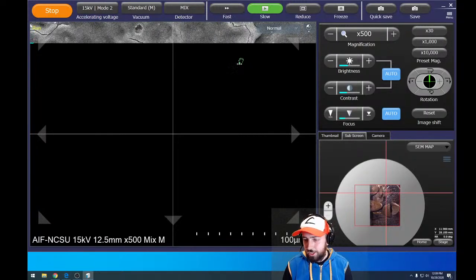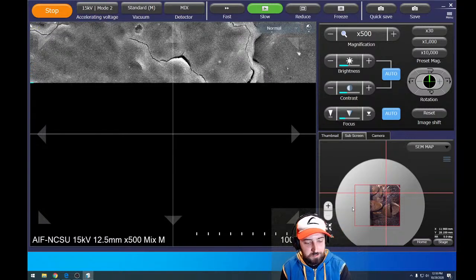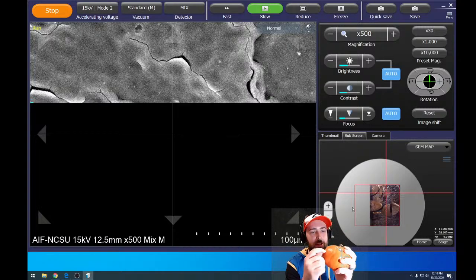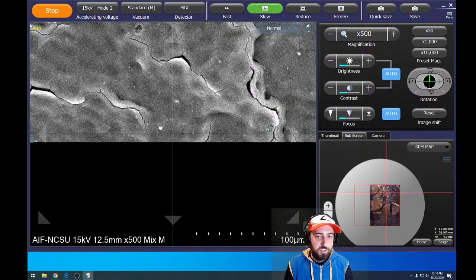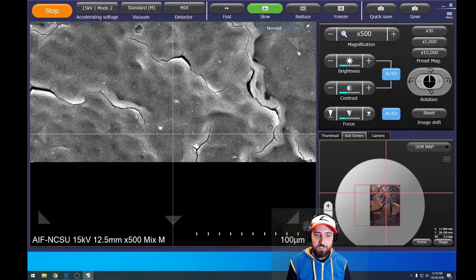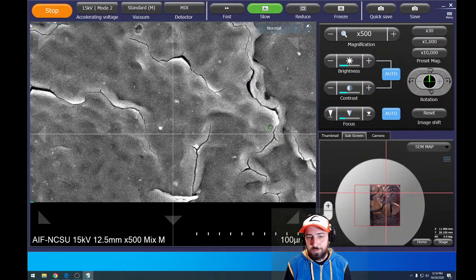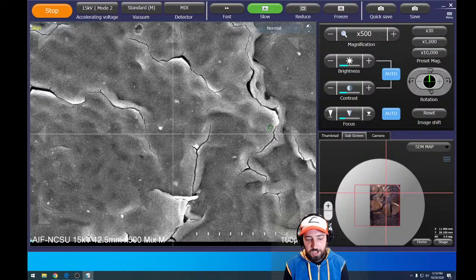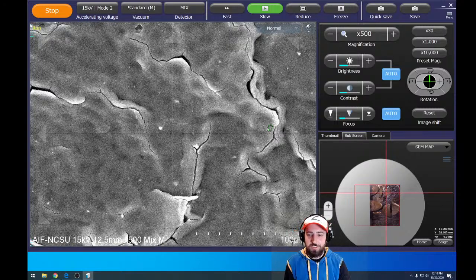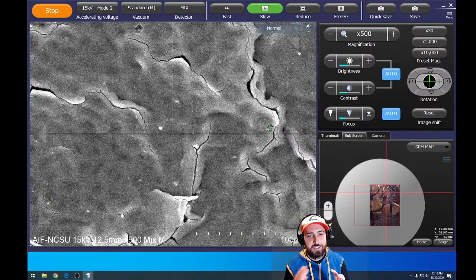And now this is the pumpkin skin that I showed you in that first picture. Now remember it was orange, but we didn't see a lot of texture. And really, we know that pumpkins are kind of bumpy, but to me, they look kind of smooth between those ridges. And so what I'm seeing here is a lot of cracks and things. Now, the reason I wouldn't want to put a whole pumpkin in there is because it does contain a lot of water. So even though I only took a vegetable peeler and shaved a very small portion of this pumpkin and then put it in the microscope and our gold coater, that removes all the water. So I think what we're looking at really is that skin is kind of cracked.